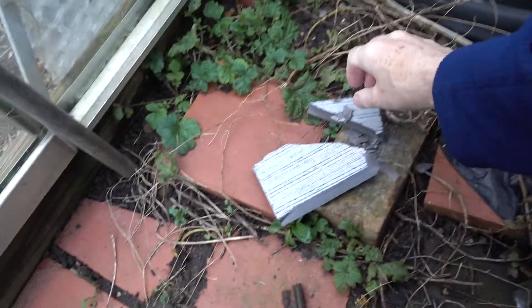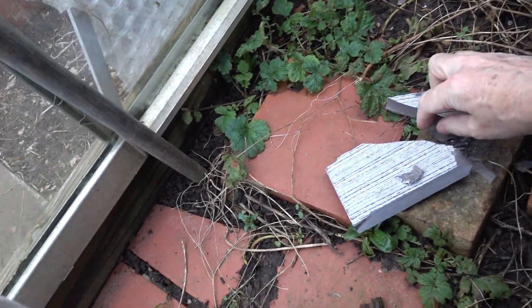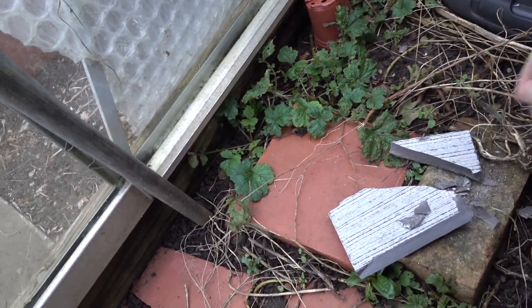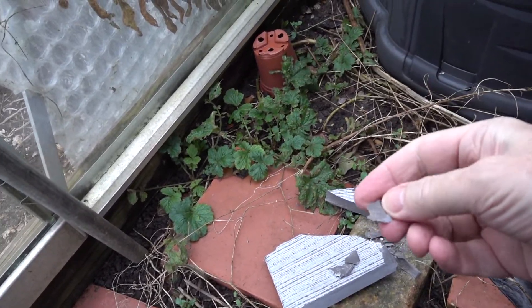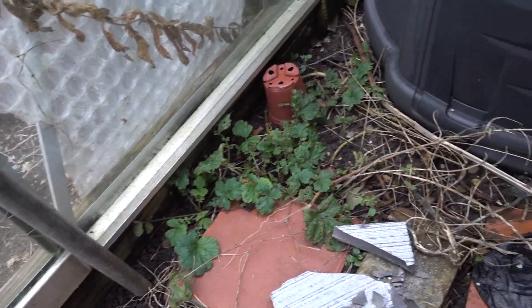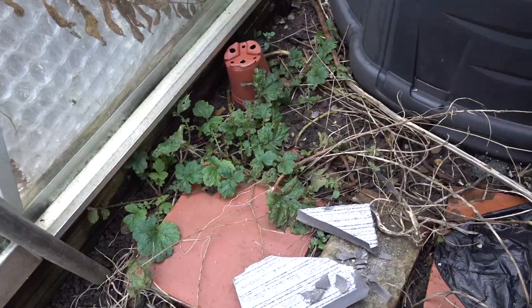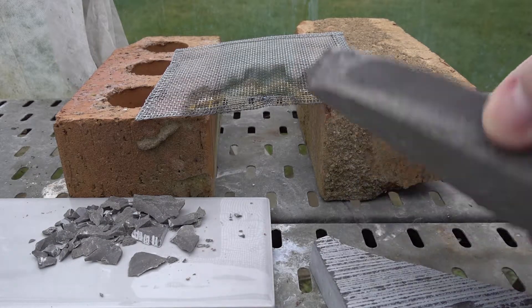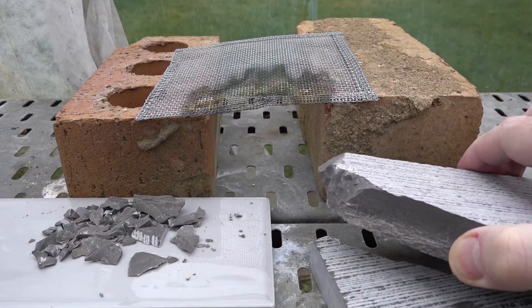You should be able to see that we've got some nice thin chips there — there's one, there's another quite thin one, and one falling down the side. We can use those in an experiment to see what happens on heating limestone.